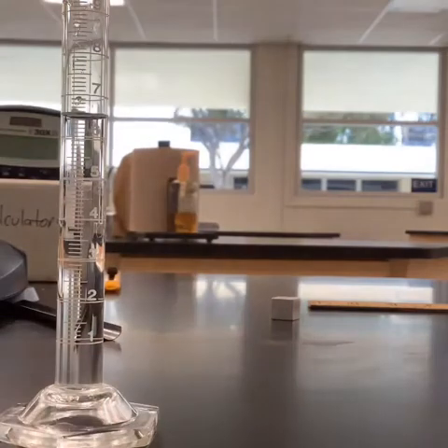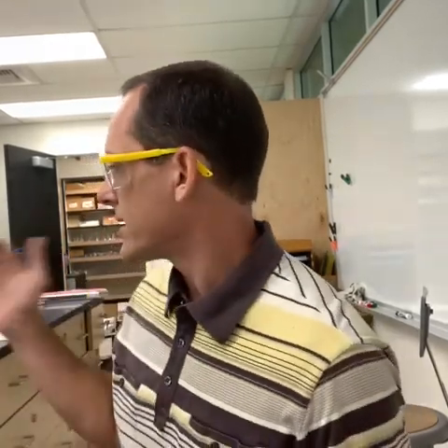Now we have all of our data. All right, so now we've got all of our data. We've got our data for our water, we have our data for our rubber, and we have our data for the aluminum. And so using that data, we're going to make sure that we organize everything neatly, and we're going to clearly calculate and define what the density for each one of those things are. Now, when we're talking about these things, the densities for these values are what we say are experimental values. They're what we actually got in the lab.